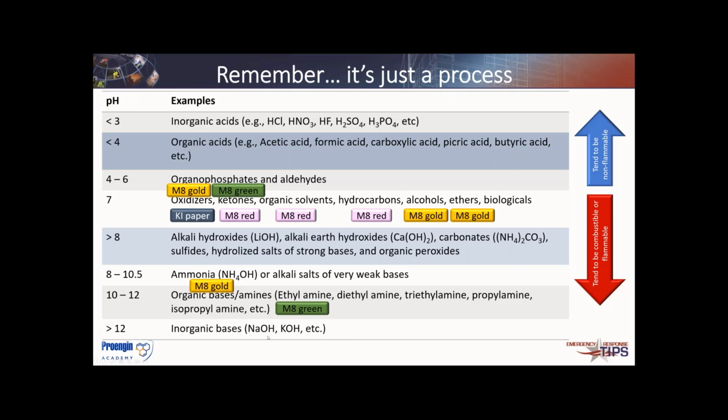And now one thing I do want to remind you, sodium hydroxide and potassium hydroxide at really high concentrations also tend to do that thing where you put dry pH paper in and you see no response. So it looks oily, it kind of falls right back off of it, and you think, it's an organic. But unless you put the wet pH paper in, you won't see those high concentrations because there's not enough water to work.